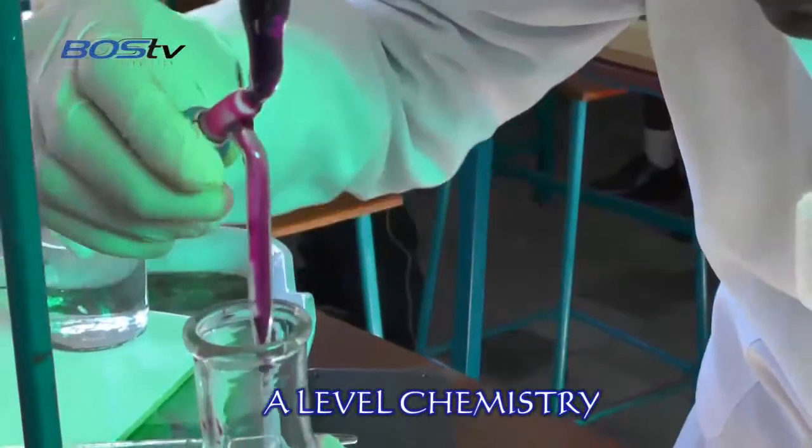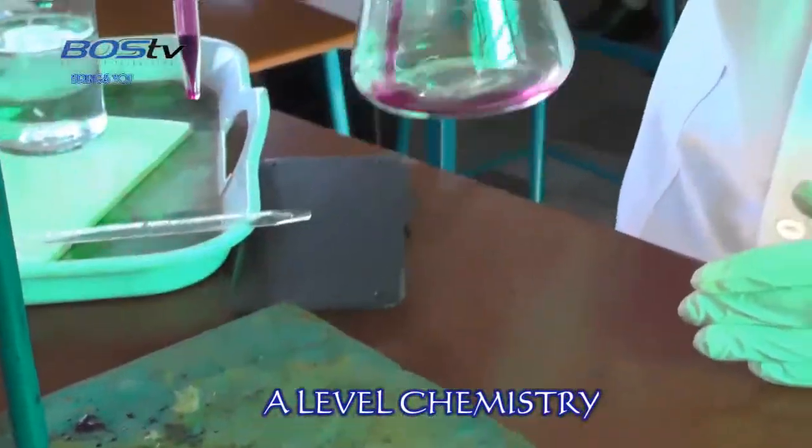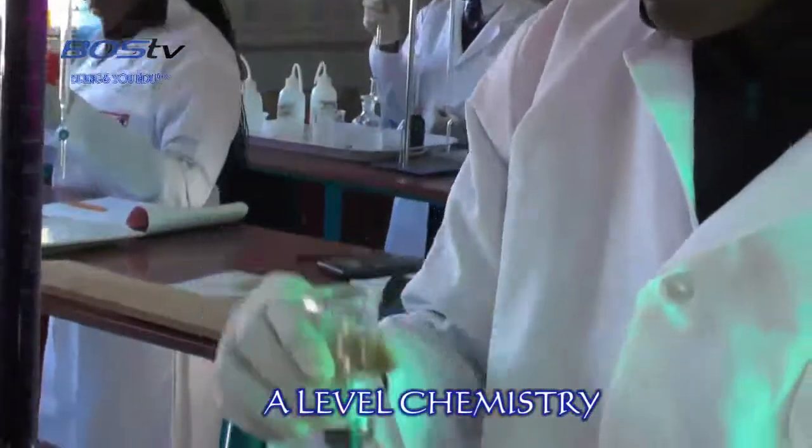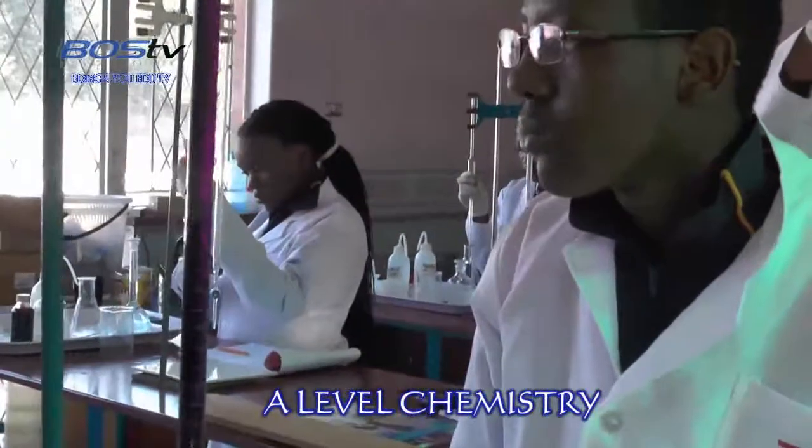After filling your burette with FA3, allow some to run out first before you begin the actual titration. Allow some of the FA3 to run out from your burette before you do the actual titration.